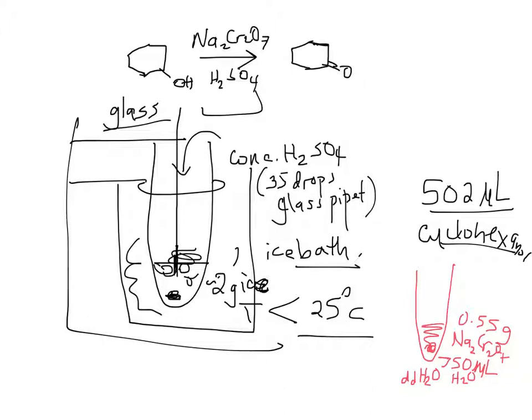Once dissolved, add this to your reaction broth as the last thing, again dropwise—drop Mississippi, drop Mississippi, that slow. This addition will probably take about five minutes. It's a relatively small volume, but if you go drop by drop with continuous stirring, it should take four to five minutes for complete addition. After you've done the addition, remove the ice bath.